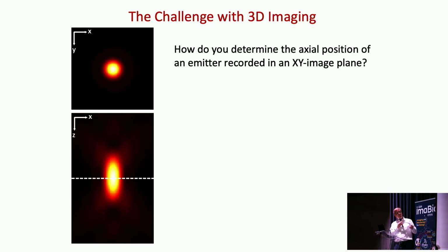And the second problem is that if you stay close to that focal center here, this is about a 700 nanometer or so distance here. Within the inner 300 nanometer or so, the point spread function hardly changes. We know that actually all the time when we focus our samples on the microscope, let's say beads for calibration purposes, it's very hard to do the last little adjustments of that focal plane to get them perfectly in focus.